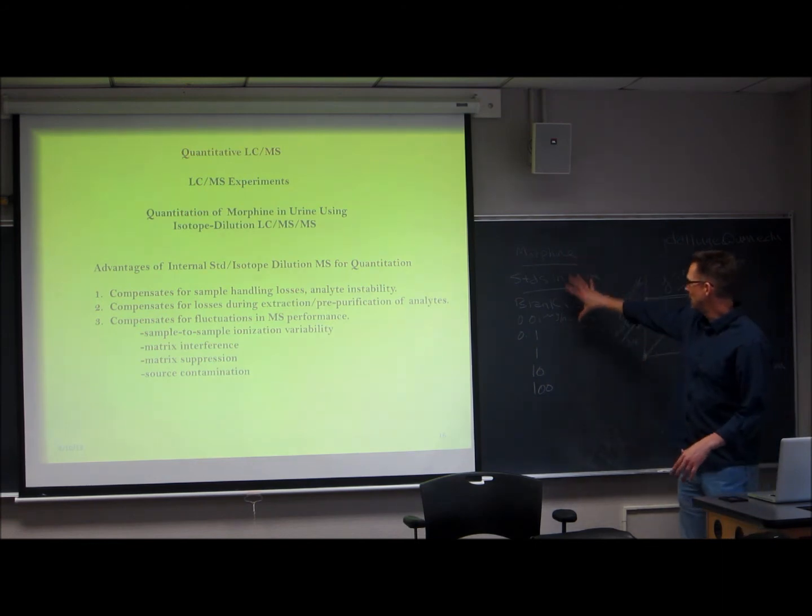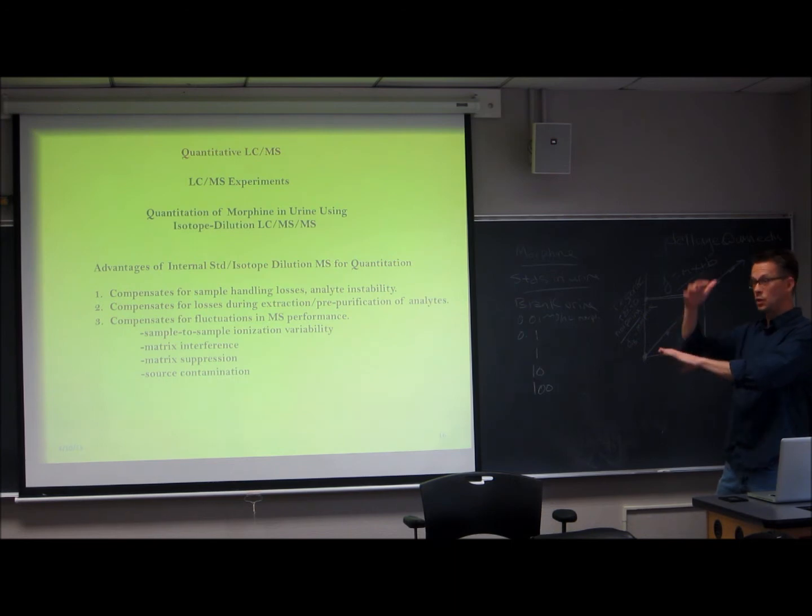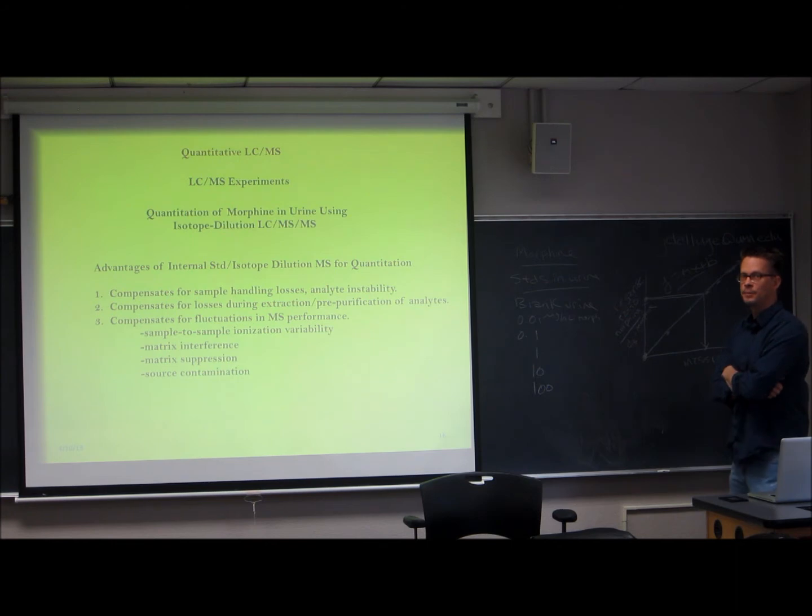Because if I make up my standards in water, the mass ratio and the response ratio remains constant. Even if I go to a sample that's in urine, the urine's going to suppress that signal, but the ratio is going to remain unchanged. So you no longer have the absolute requirement to make up your standards in the same matrix.